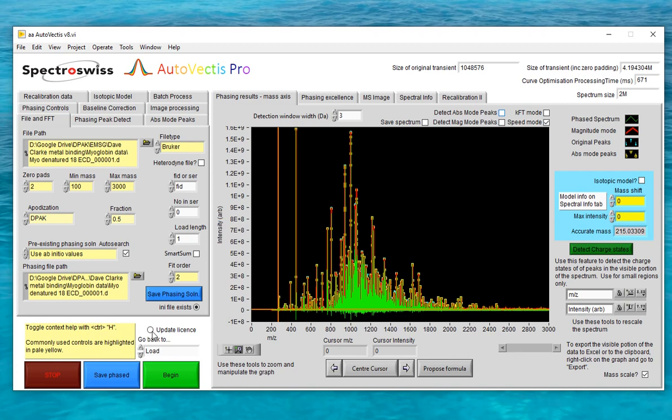As I've just demonstrated, ab initio mode is so easy to use that for users who are processing Bruker ICR data, we recommend it as the standard route to use for producing absorption mode spectra. For users who are processing ICR data in the MIDAS file format, that can also contain information about the ion excitation in the cell, and that will also allow you to access the ab initio route. But if you're a MIDAS user, please contact us directly for specific training on that file type.